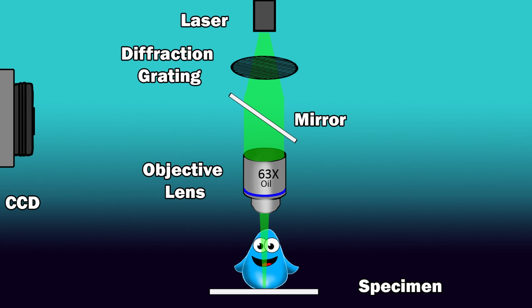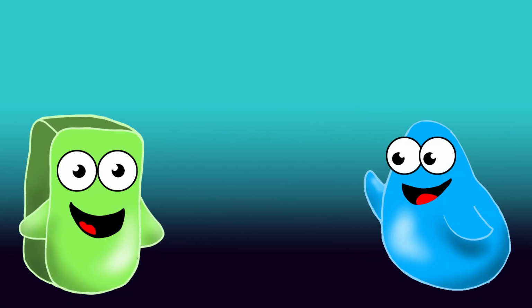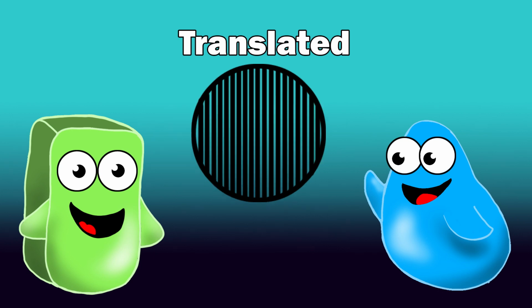After the light passes through the grating, it illuminates the sample and excites fluorescent molecules within the specimen. The patterned light generated by the diffraction grating superimposes with the high-resolution features within the specimen, creating a moire pattern. To create a single super-resolution image with this technique, the microscope must take 9 different images, each with the diffraction grating slightly translated or rotated like this.